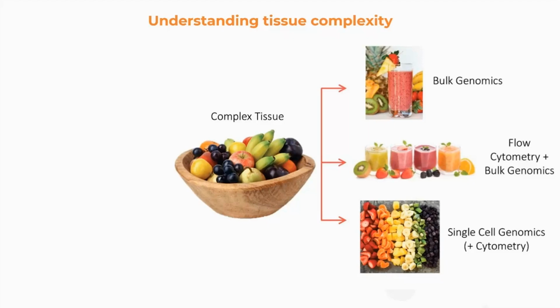When we look back, with bulk genomics, this fruit salad analogy is probably overused at this stage, but it gives you an averaged expression count for all the transcripts that you've looked at. I don't really have an appreciation for lowly expressed or highly expressed, and it averages out your signal.